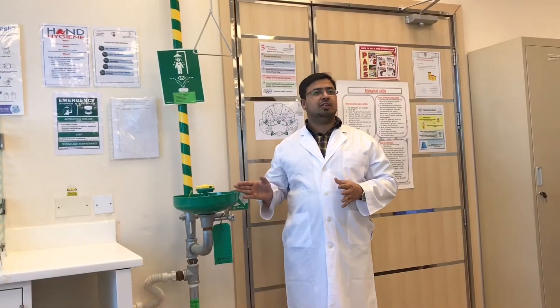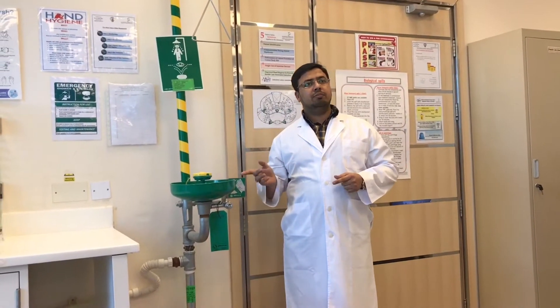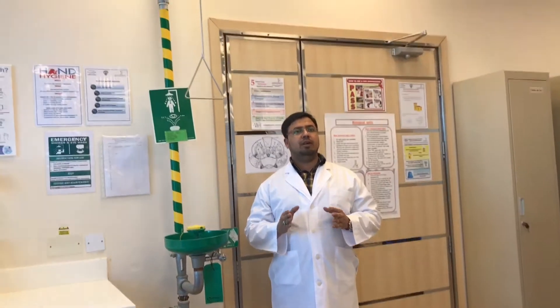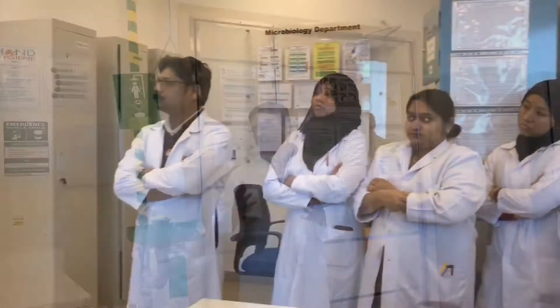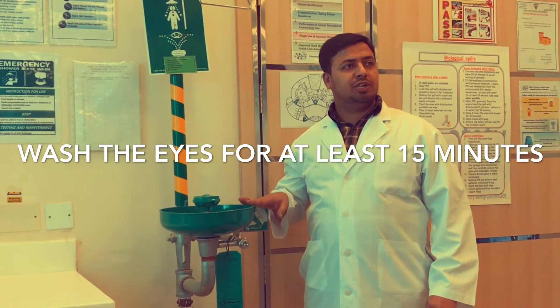We have this facility of an eyewash and shower station here in our lab. For any emergency involving a chemical spill or any other type of spill on the body, we need to know how to use it. If we get splashes into our eyes, we need to immediately rush to the eyewash station.